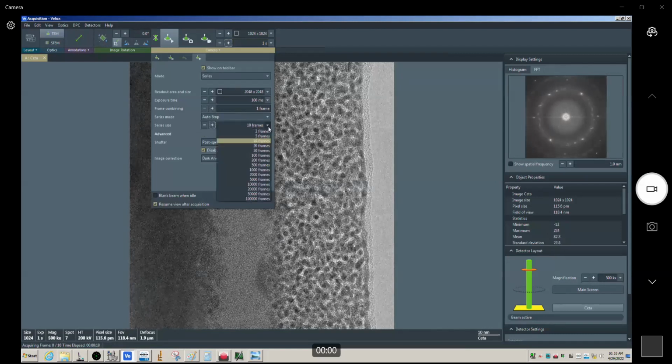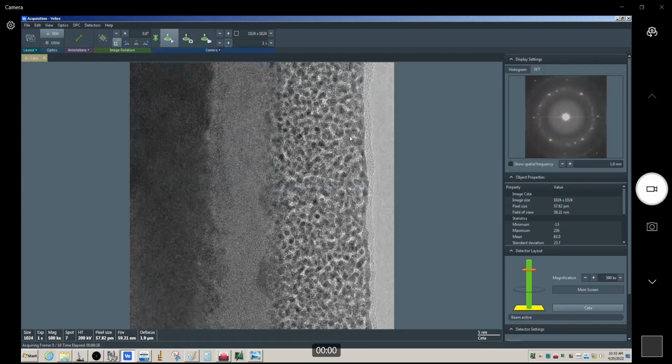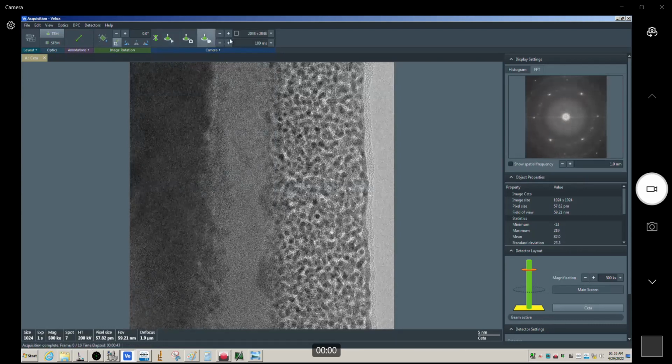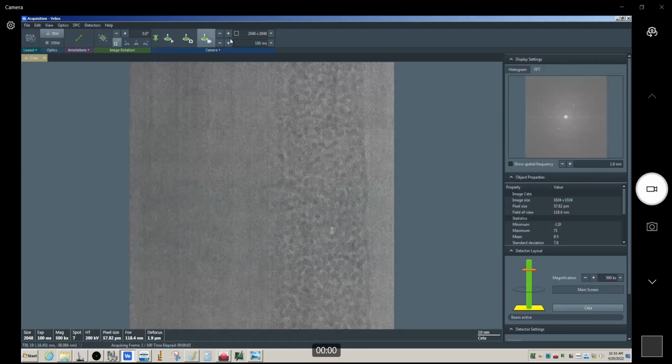This is going to let us do a bunch of them, so we'll do 100 frames. 100 frames at 100 milliseconds a frame. All right, so we'll go ahead and do it. While we're doing it, I will continue to talk to intentionally give it a little movement, because it should obviously be able to account for that. And here we go. All right, so there you can see.